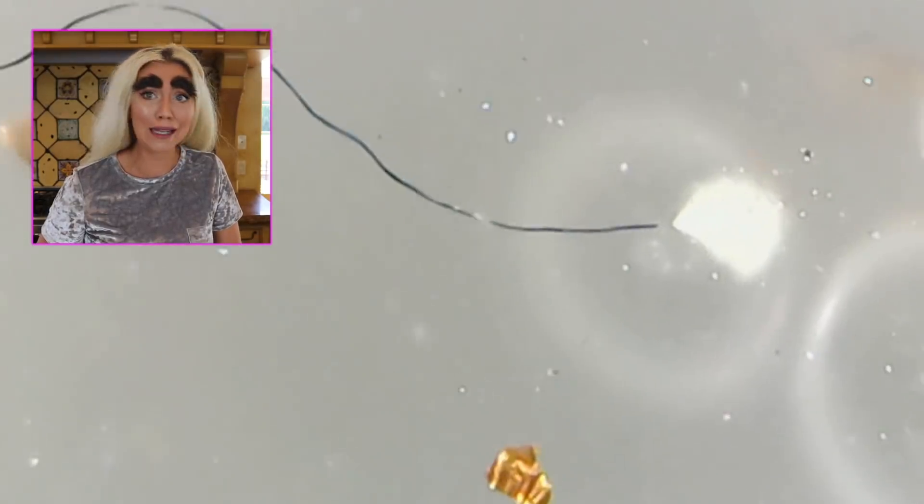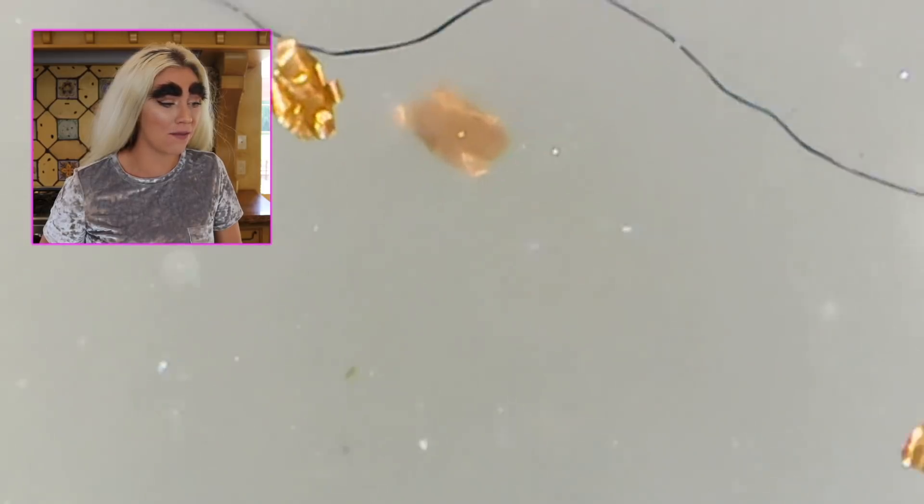This is a star glitter. Oh my god, it looks like dirt and specks of weird stuff. There's dots everywhere. Ew, look at that hair — I don't know whose hair that is or where it came from. The worst part is I can't even see that hair in my slime — it's a super tiny little hair. Oh my gosh, look at that — that is a floam bead. And don't tell me there's another hair on the floam bead. That is enough of that slime. Let's move on.